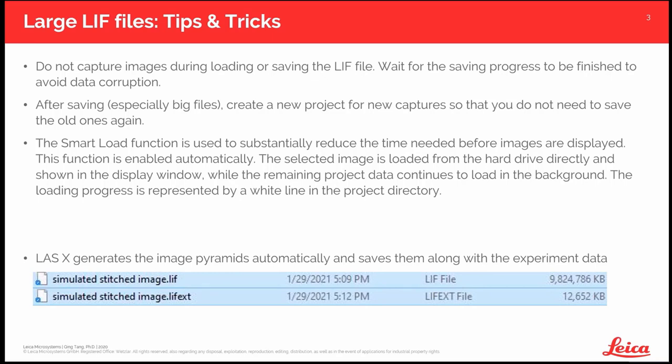During loading, we have a smart load function. You will see a white progress line under each large image set. Wait for the line to be gone before you review that particular image set. And in the file folder, you might notice there is another file called LIFEXT next to the large file. This is called Image Pyramid. Treat it as a thumbnail image with a large LIF image file. So copy both files when you transfer the data.